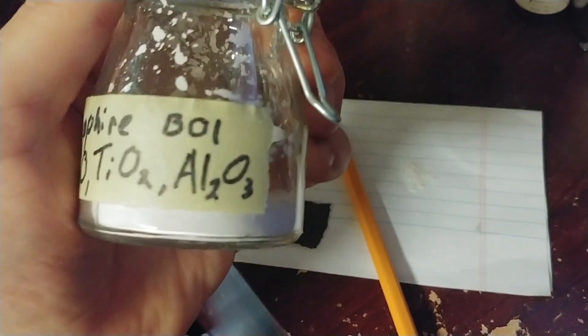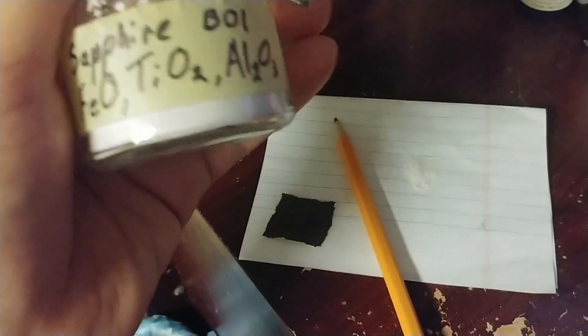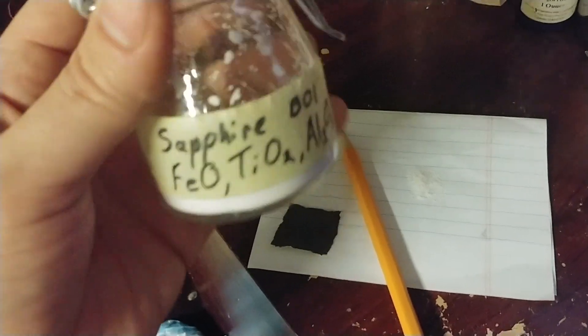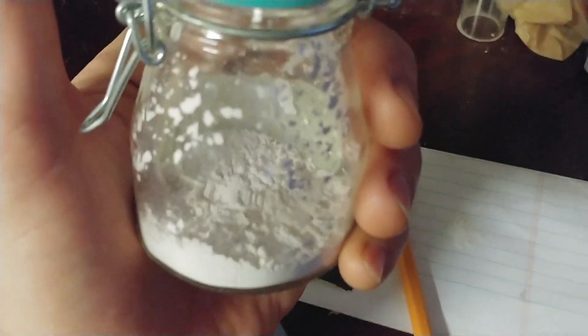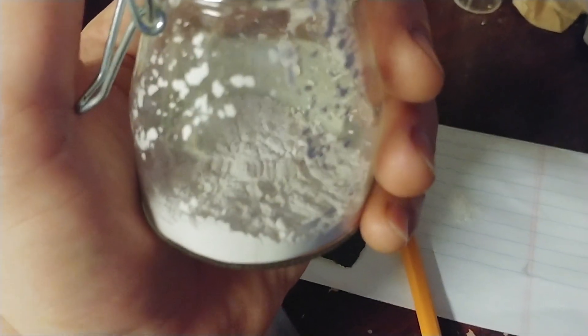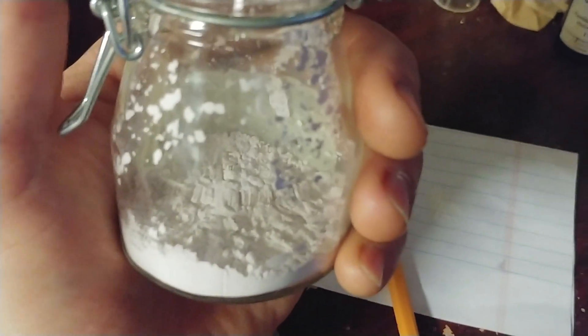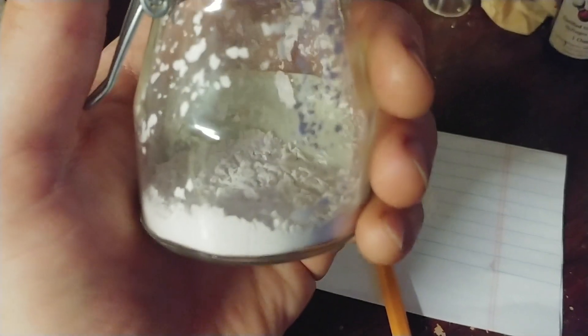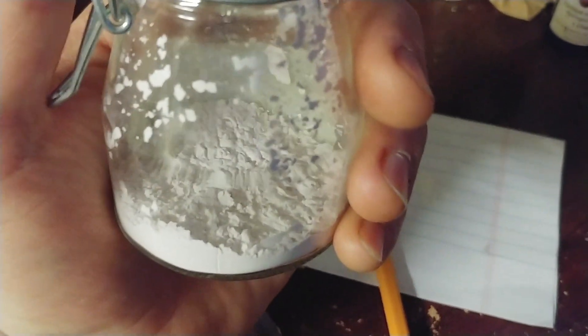So this is one of my batches - batch one. I've got four different batches that I've made, but I keep them labeled. In a way this is also a little update video on where I'm at with synthesizing corundum, and I can tell you I'm not any further than the last videos. I've not had the time or the financial resources to complete my furnace.